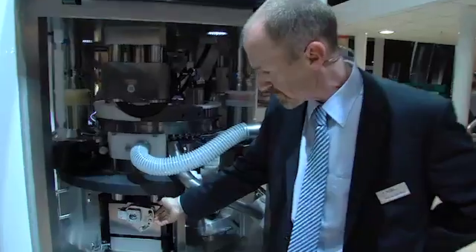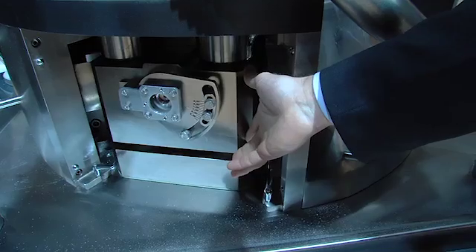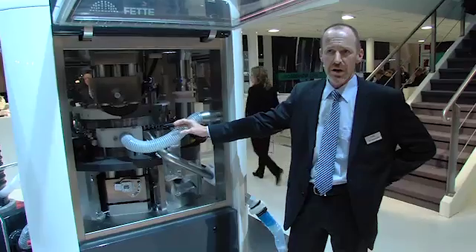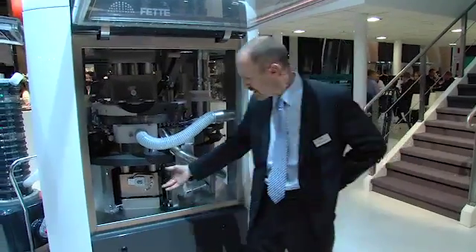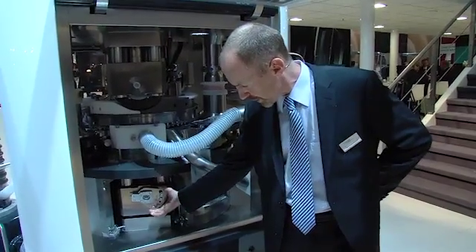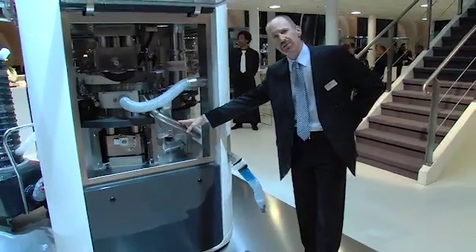Moving directly below, when the FE55 is operated in the bilayer production mode, there is a redesigned first layer sampling mechanism. This is a pneumatically actuated mechanism that can temporarily increase the hardness on tablets for first layer samples and go back to normal operating mode in only approximately four and a half seconds total. The adjustment mechanism is conveniently located on the front with a calibrated range easily accessible to the operator. First layer samples, when compressed, are diverted through a corner-mounted discharge chute via stainless steel tube.